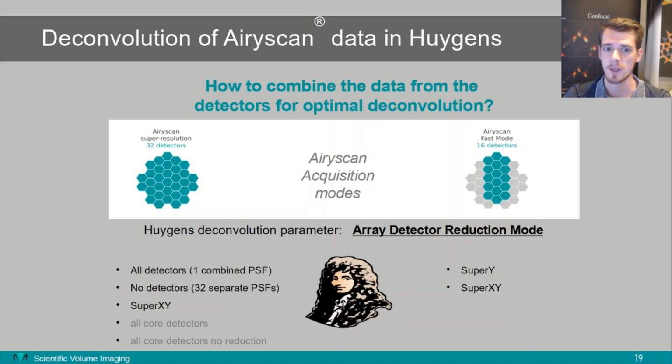But after selecting your method of choice, this is all handled automatically within the pipeline of the Deconvolution Express or the Deconvolution Wizard, so no manual pre-processing needs to take place. And all of these methods heavily benefit from GPU acceleration.